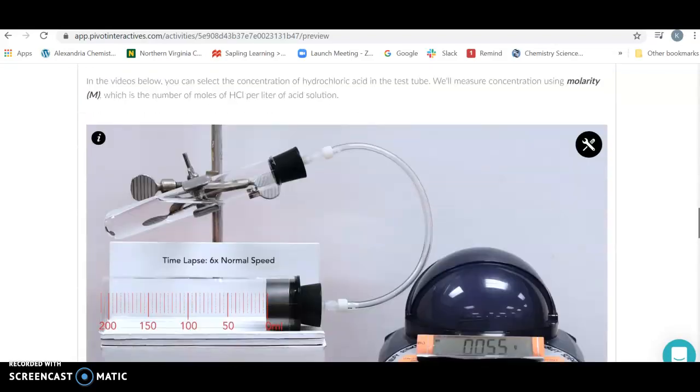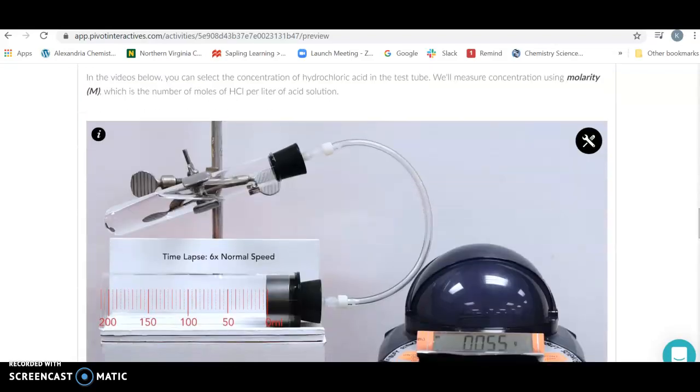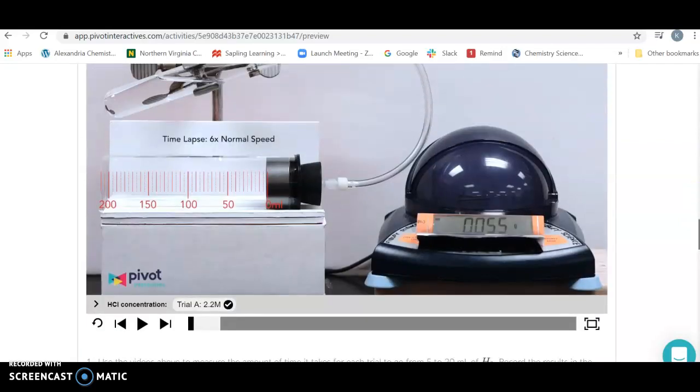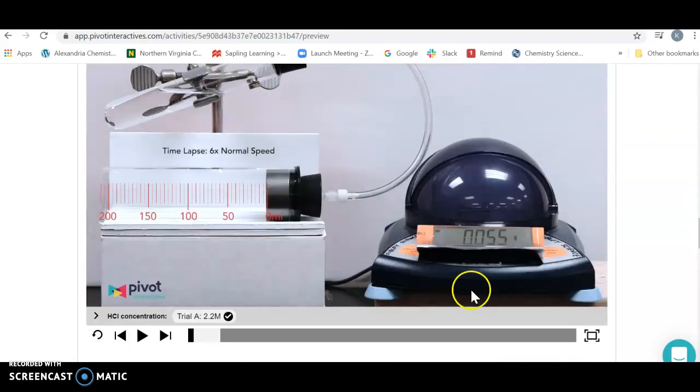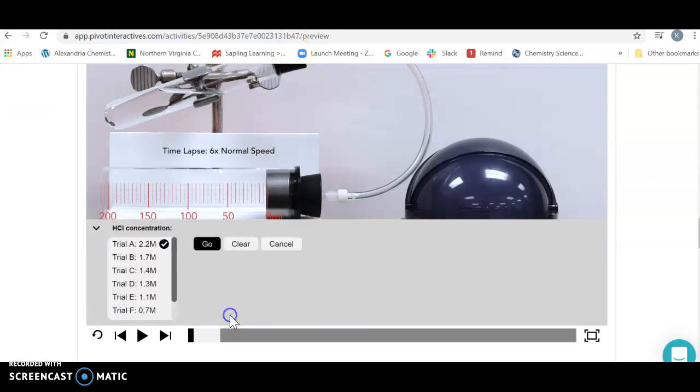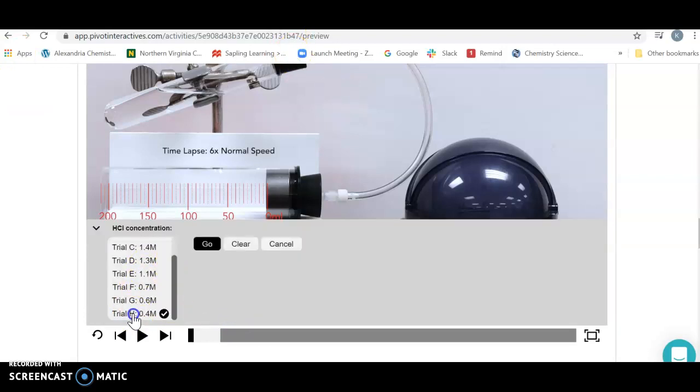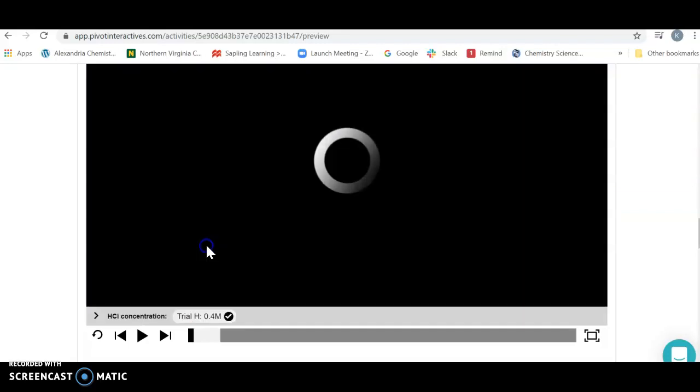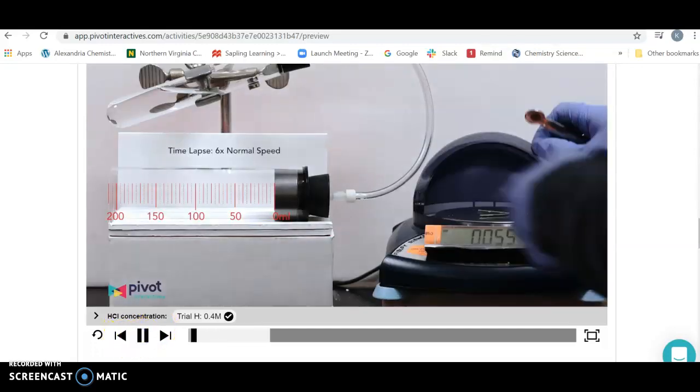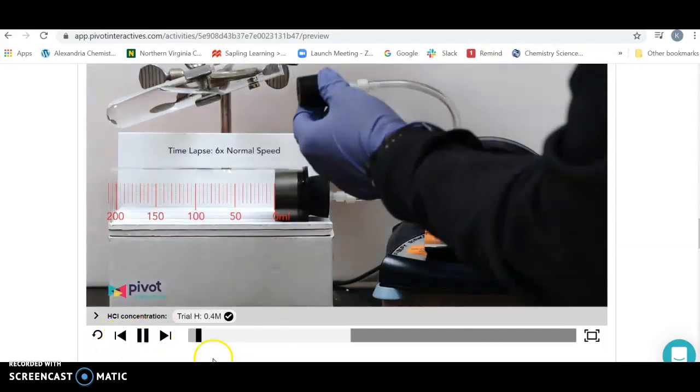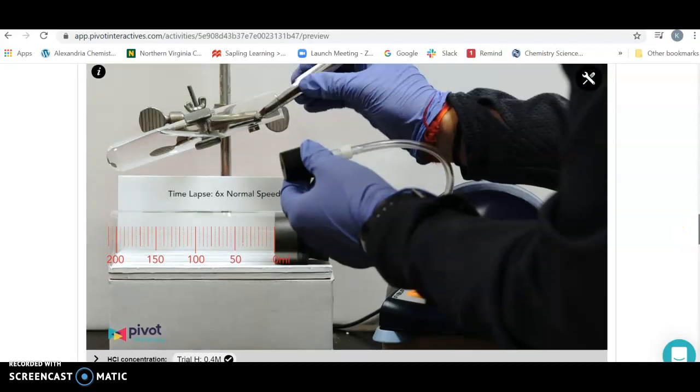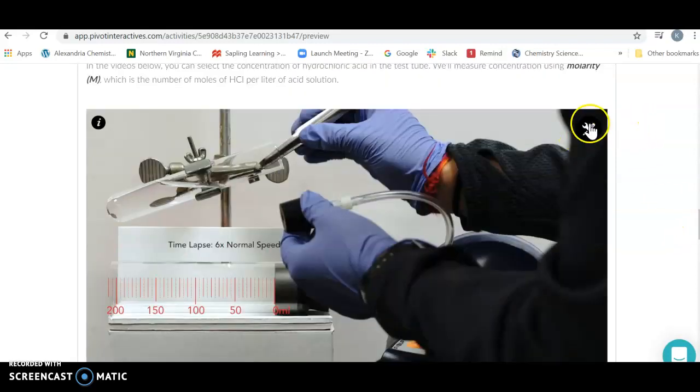In part two we're actually going to do the experiment. We're going to vary concentration of the HCl and see what happens to the rate. To me it makes more sense to go from dilute to concentrated, so I'm going to start at the very bottom. I'm going to press the go button. Note my tools are gone. Pause that. I've got to get my tools out, get your stopwatch.